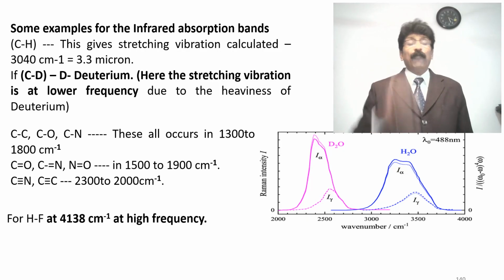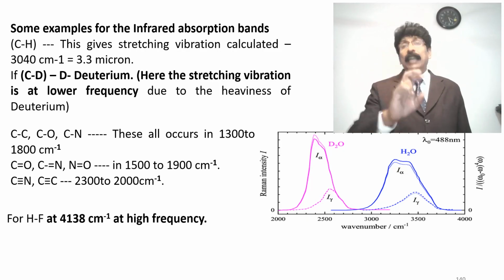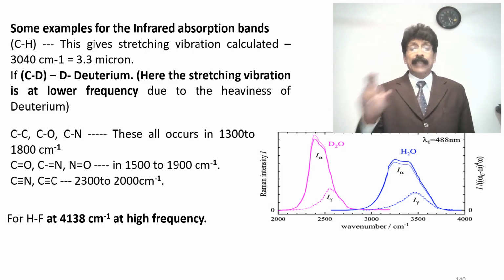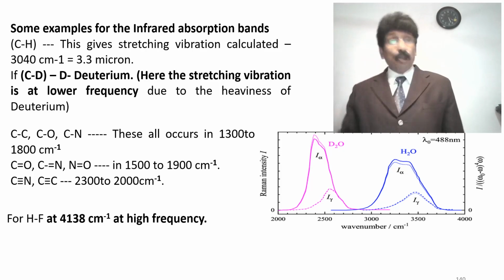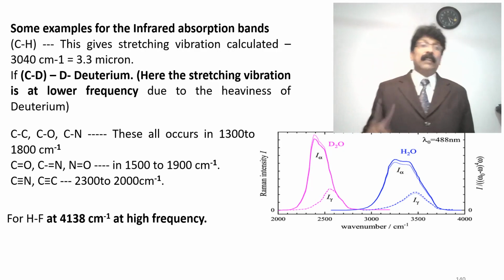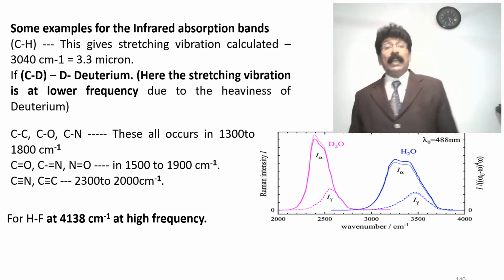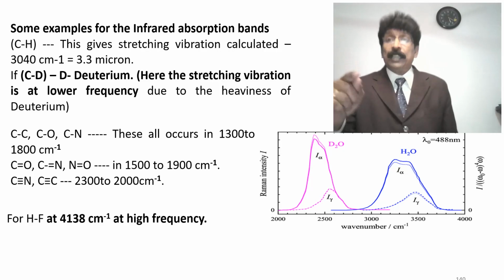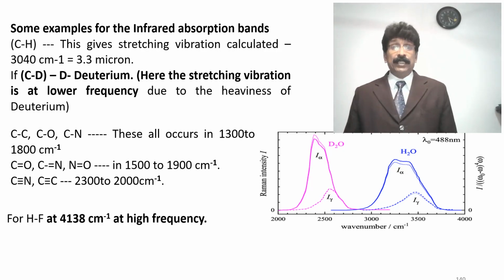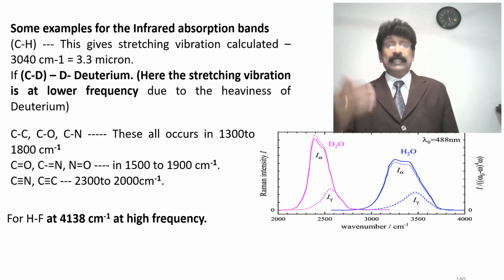And for hydrogen attached with fluorine, HF, at 4138, not 400, 4138 centimeter inverse at high frequency, you can see the vibrational energy when hydrogen is attached with fluorine.